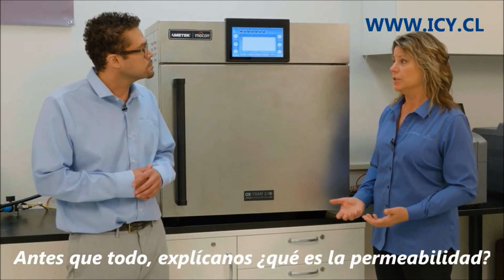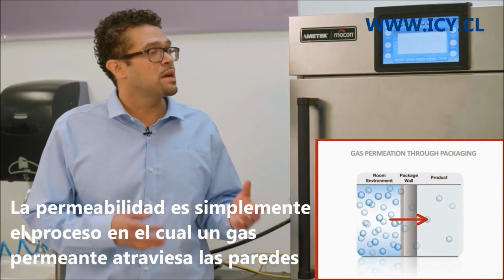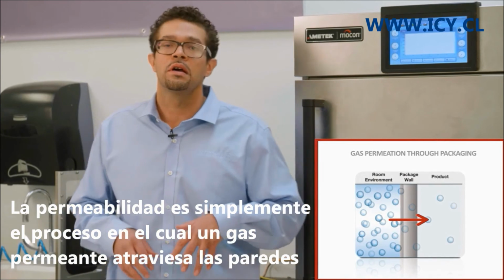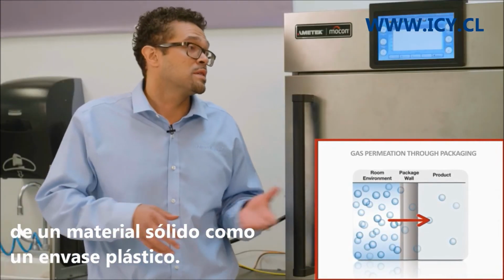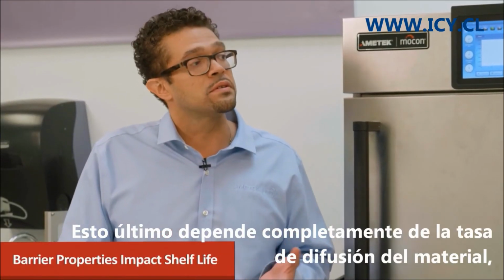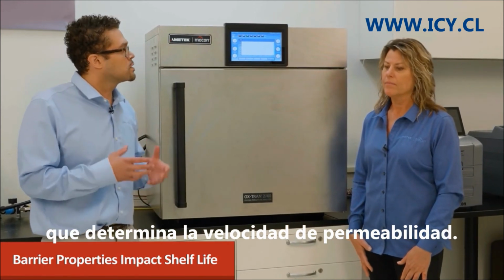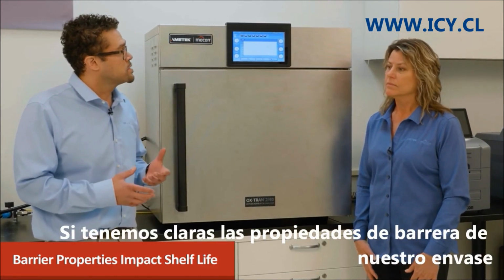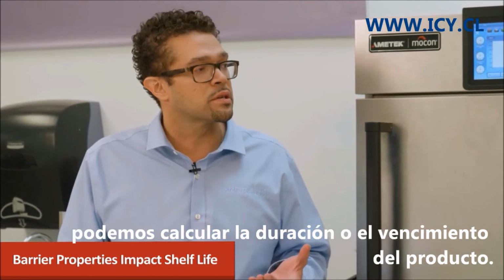So Michael, before we begin, let's talk a little bit about permeation. What is permeation? Sure. Just in a nutshell, permeation is simply the process by which some permeant is permeating through a solid material, which could be, in this case, a packaged sidewall. Right. And it's really all dependent on what that material's diffusivity is, how fast that process is. So if we understand the barrier properties of our packaging, that allows us to properly calculate the product shelf life.